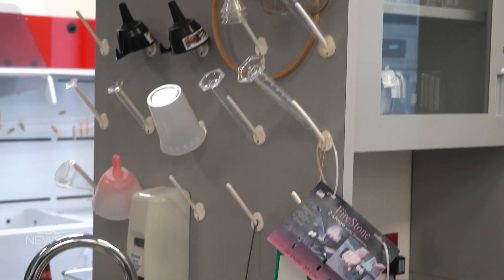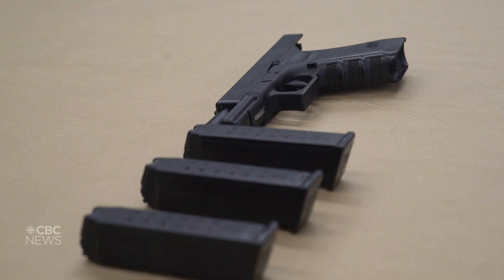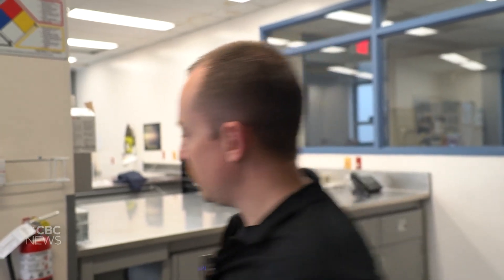This is our primary lab. This lab is essentially for processing of evidence and exhibits. We have a couple of different areas that we specialize in. When we do get firearms that are seized, they generally come to us right away for processing, and I'll show you that process right now.